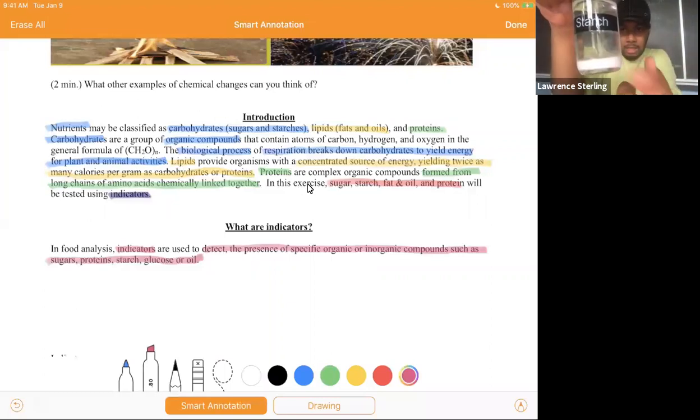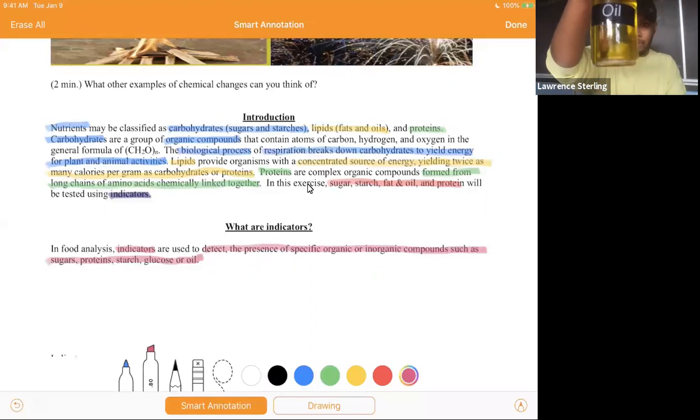And if you can see, the starch is actually very much settled at the bottom. So you need to shake, shake, shake your starch up. That's starch. Then you have protein. And yes, it smells as bad as it looks. And then you have oil. If you remember, oil is a type of lipid, doesn't mix well with water.